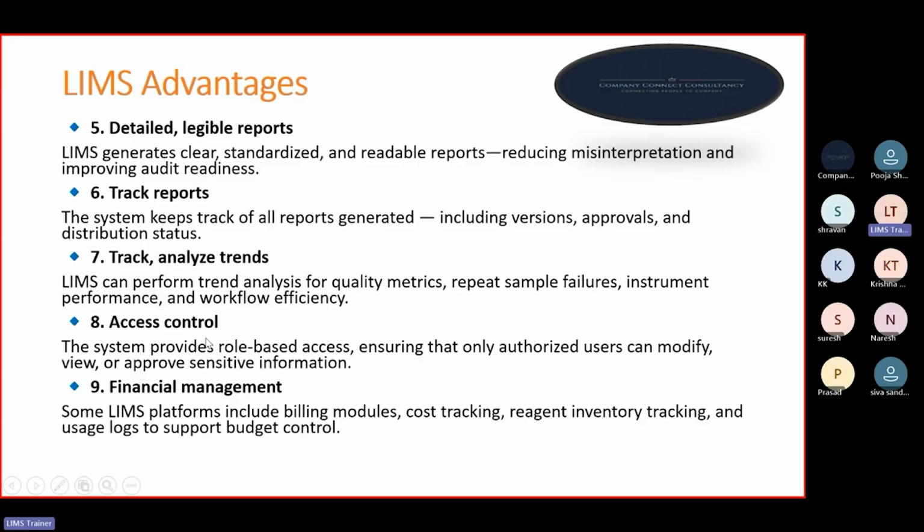Here we have the access control. The system provides role-based access, ensuring that only authorized users can modify, view, or approve sensitive information. Like I said initially, there will be a hierarchy of user access. Team leader can only have his own access, analyst can have his own access, reviewer can have his own access, and then approver can have his own access.